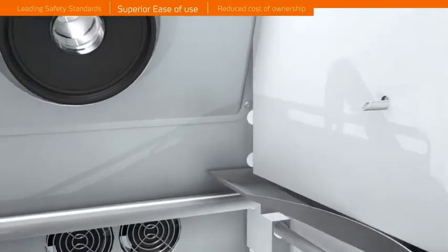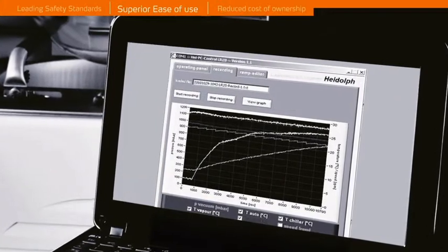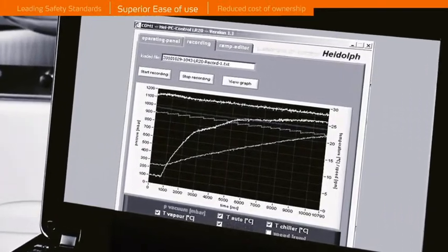Connect your PC to the RS232 interface to view and control your process parameters. An optional software package saves all your process data and allows for pre-programming ramps.